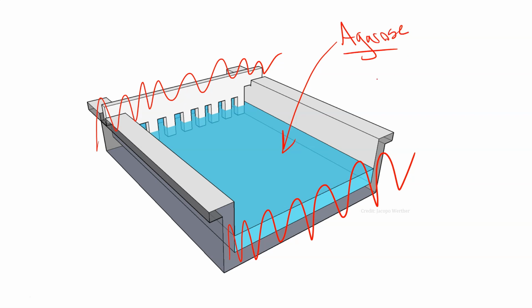Agarose is made out of agar, a molecule derived from seaweed. At hot temperatures it's all dissolved and it's a liquid, but as it cools it solidifies. The molecular structures in agar or agarose are such that when it cools it creates pores, so it allows molecules to actually get moved through.